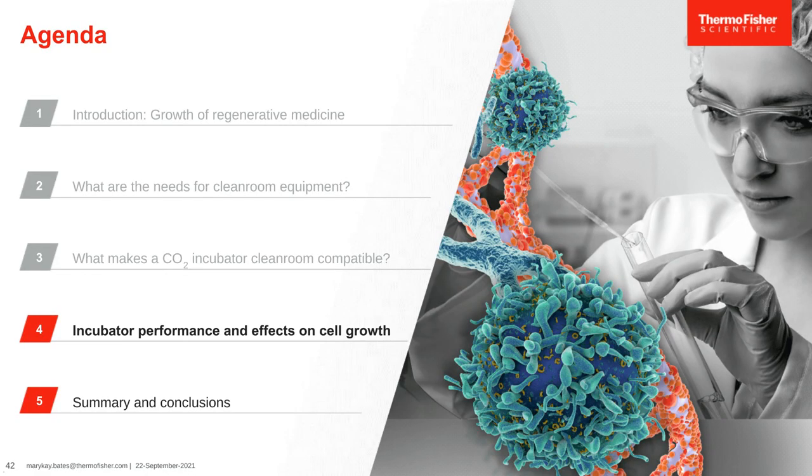All right, so finally I want to finish up talking about the incubator itself, because while I spent a lot of time talking about the clean room and why that's challenging and why we've thought a lot about that, what it really comes down to is if your cells don't grow properly, your therapy will not be successful. So I want to spend the last minutes talking about incubator performance and how that affects cell growth.